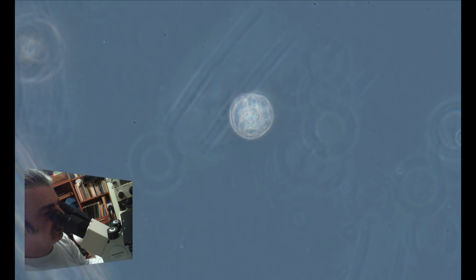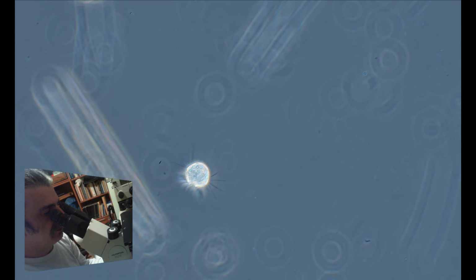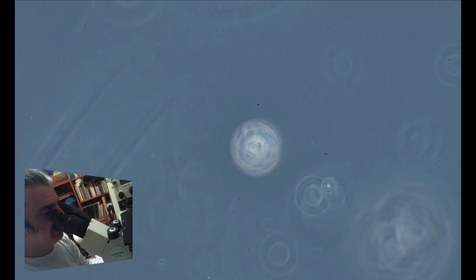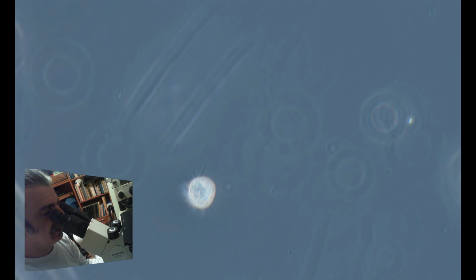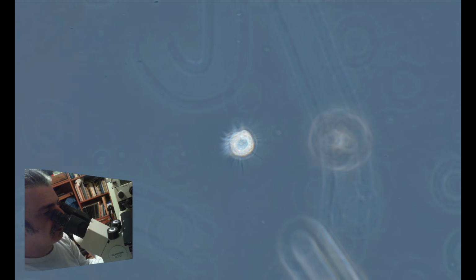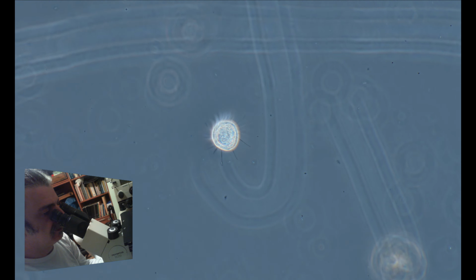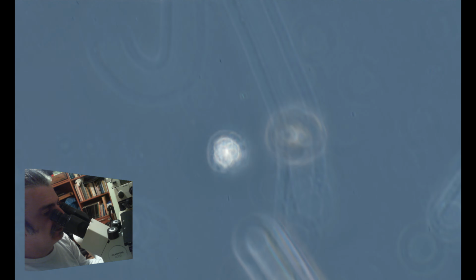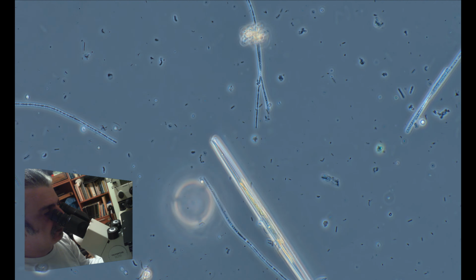Here is the Halteria that we've seen before. See, it just goes up and down in the water column, so it's very difficult to focus on it. We should stay at one spot till it comes back. Sometimes it stops. But it's a very active one.